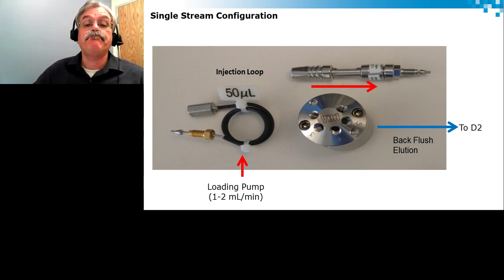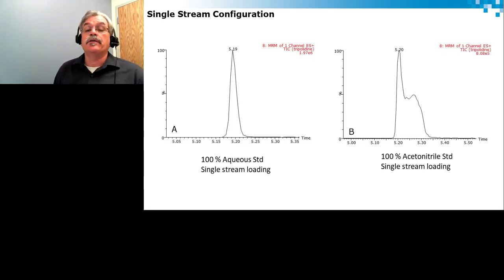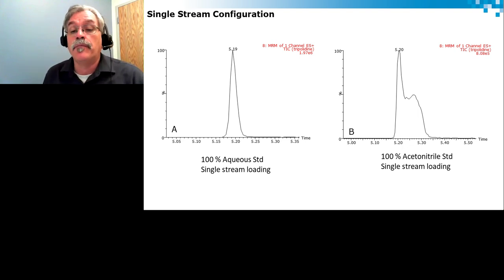Now, on this slide, we can see that we have two chromatograms. The left one is a 100% aqueous standard that was injected into a single stream aqueous loading.